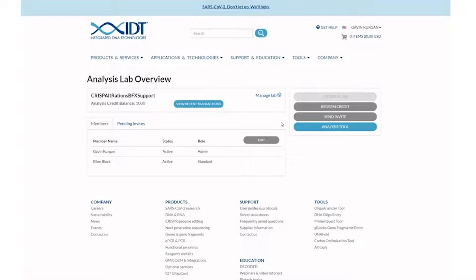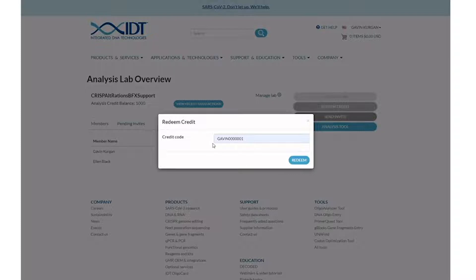The RAMP-C CRISPR analysis tool requires analysis credits. You received a code for your credits when you purchased the product. To redeem analysis credits, click the gray redeem credit button and enter your code.